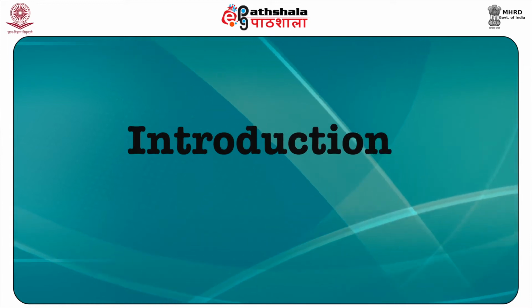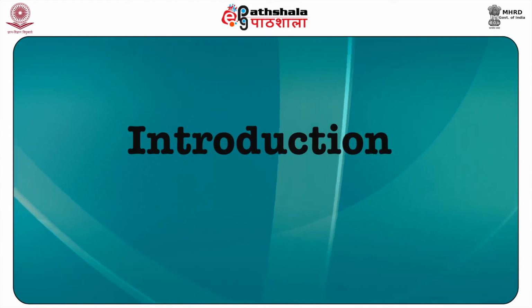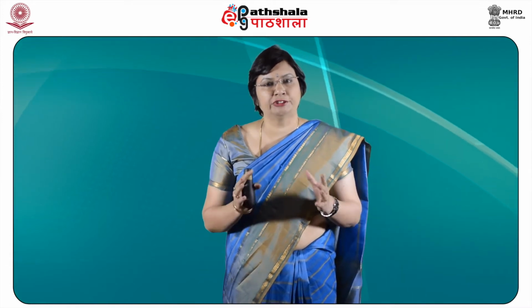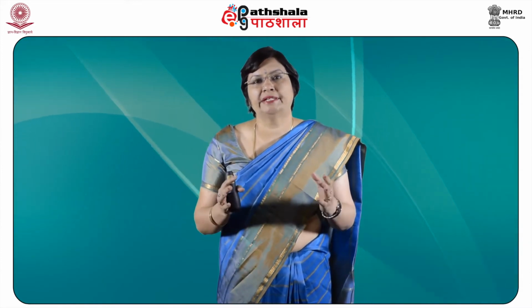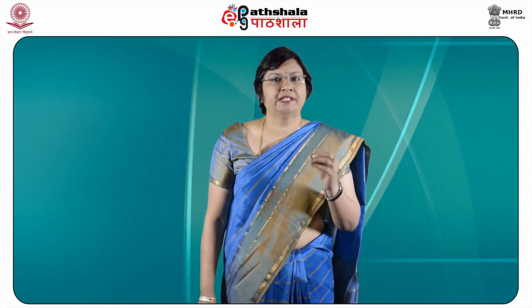So, let us begin our study of this module, dear students. The advent of modern FT NMR instruments enabled us to study advanced NMR techniques. The computer, which is built into modern FT NMR instruments, is very versatile and helps us to develop more complex and more interesting pulse sequences.